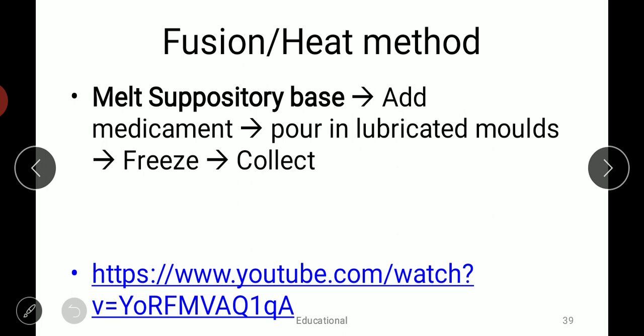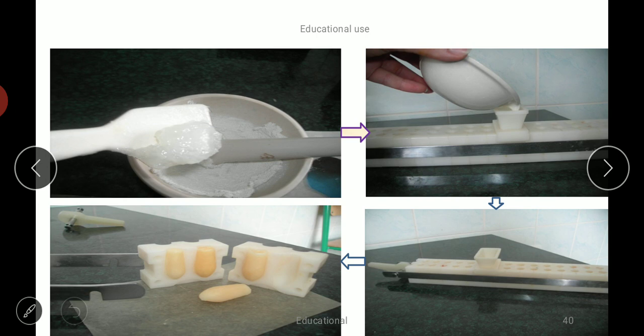Once the uniform mixture is formed, we pour it into the lubricated mold, which is already lubricated with some oil or lubricant. Then we keep that in the freezer and after a certain period of time we collect the suppositories. We need to take care that the suppository mold should be lubricated, otherwise the suppositories will stick to the mold.